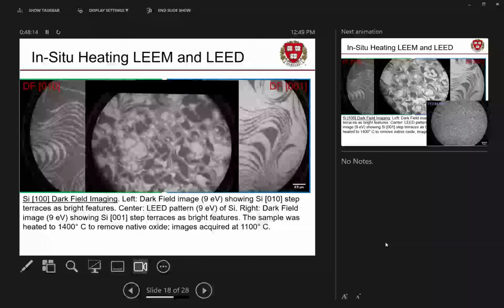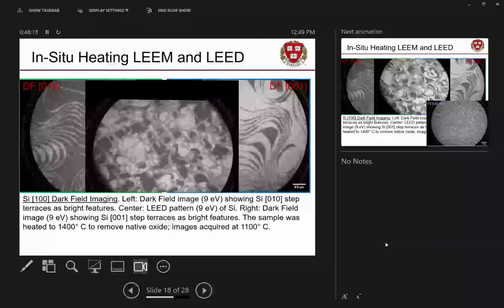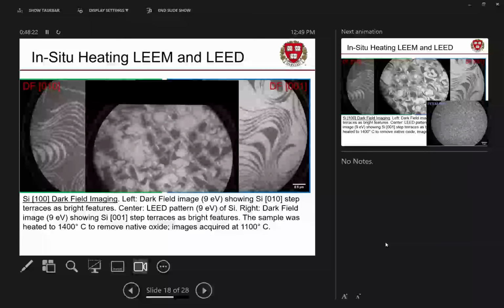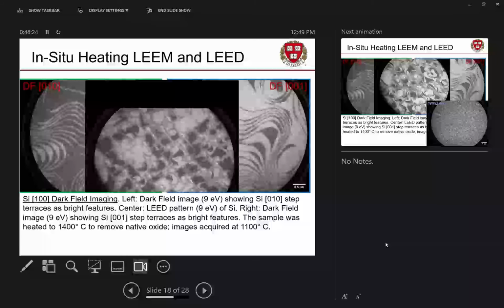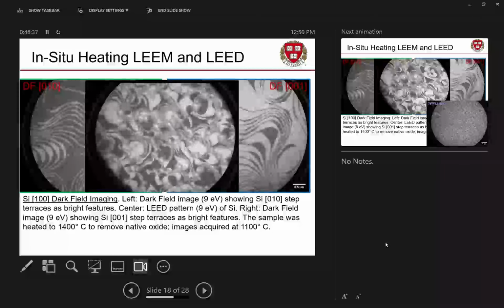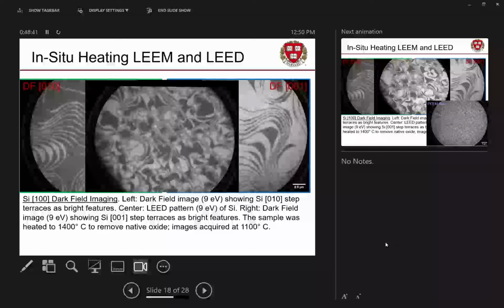But you may notice there are these linear features in here as well. This silicon is deliberately contaminated with some iron, and it's growing silicides on its surface, and those are a different material, and they block the movement of the silicon terraces. So they bounce off it like they're in a maze, and they zoom all around. Again, if you're a materials scientist or a surface scientist, this is pretty incredible. This is actually watching a thing that you read about in your textbooks happen in real time in front of you, and in a quantitative way.